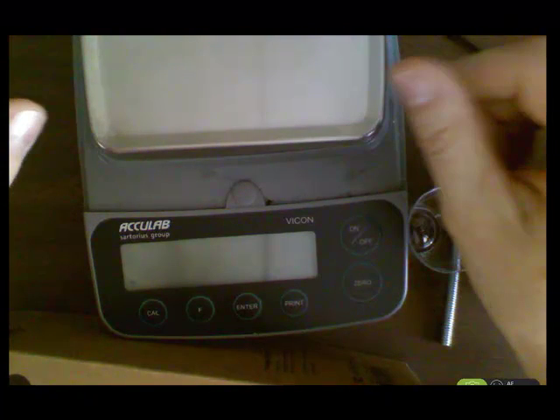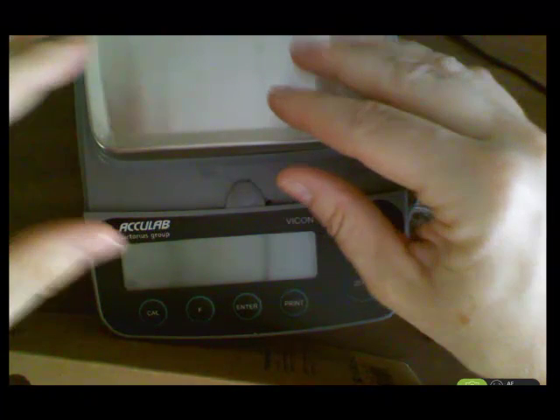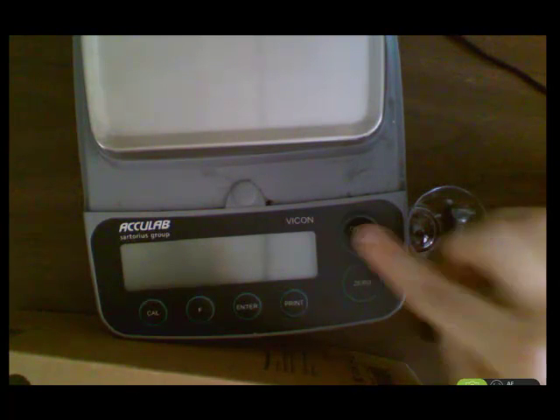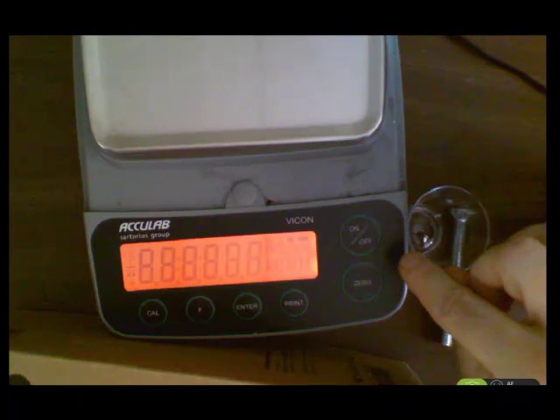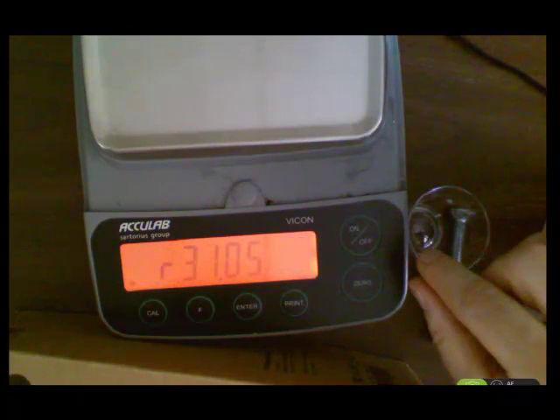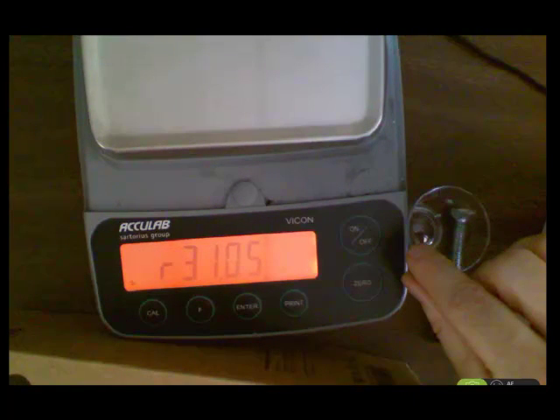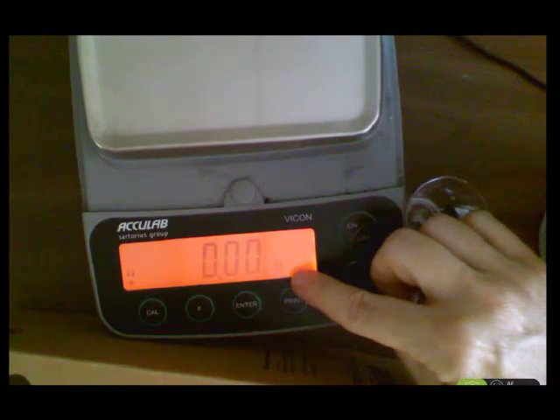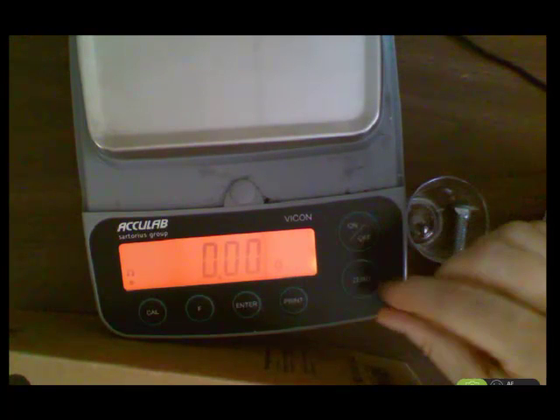Now, once you have the pan seated, it's nice and clean, then you want to turn it on. Here's the on-off button right here. And be patient and wait. It's got to boot up. It's a little computer, so you must wait. And when you see the 0.00 grams, there's a little G here that stands for grams. When you see that, you know you're ready to go.